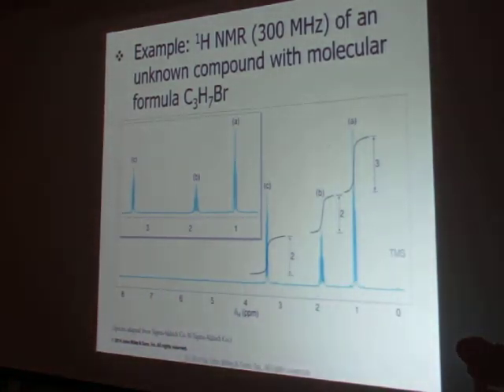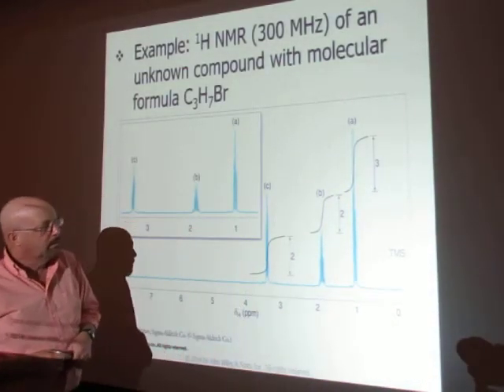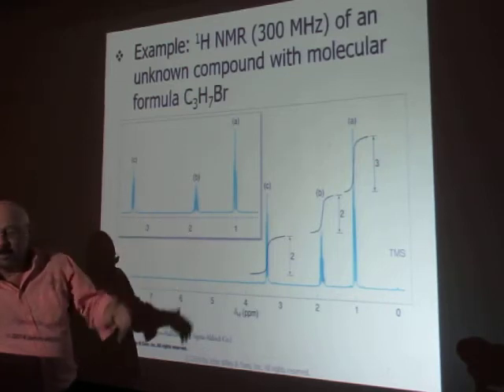But our full formula, this is CH3 next to a CH2 that's next to a CH2 that's connected to a bromine. There is my structure. If you start piecing these together, these 2 CH2s are the same ones right there. So I didn't even need this other thing down here. Those 2 are the same, and then that gives me 3 carbons. Now, that one was very easy. That's a 1 bromo propane.